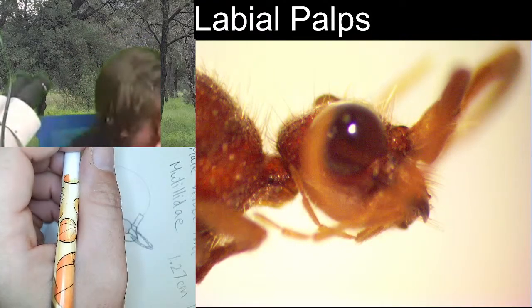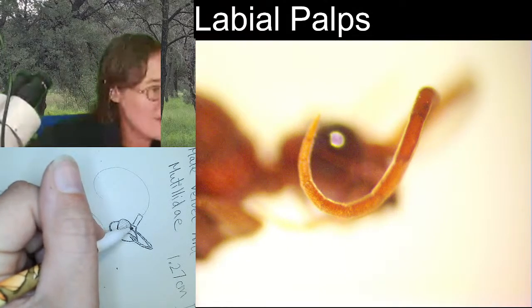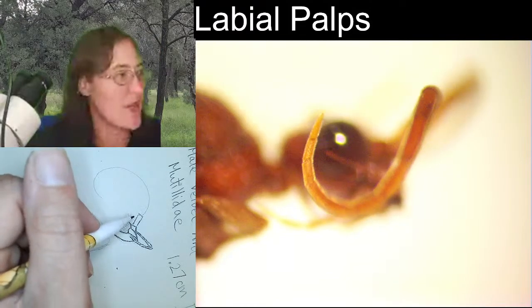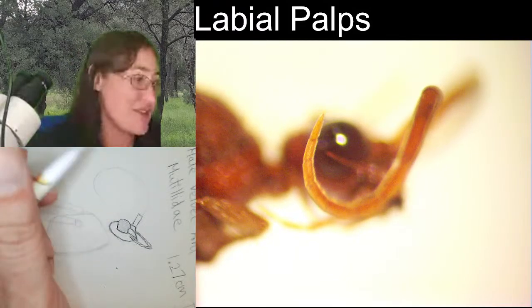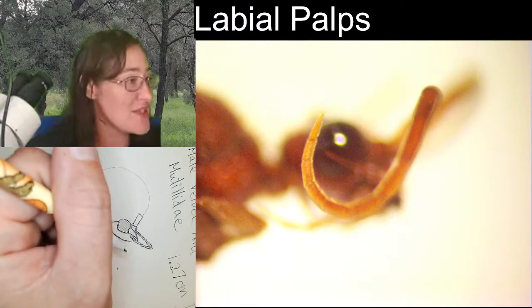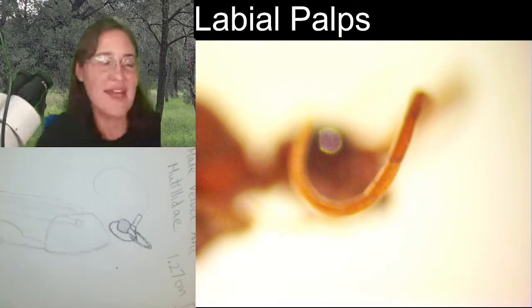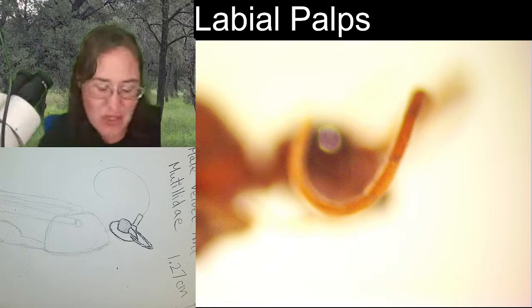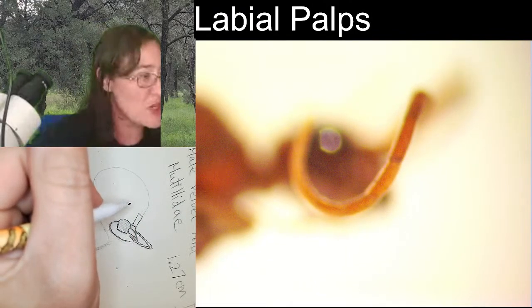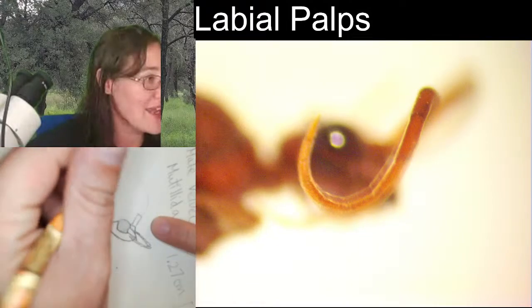Also, the antennal segments, once you get past that first segment, they do stay mostly even in width until the very last approximately 3 segments. And all of the segments are very smoothly connected to one another. That's different than a lot of the beetles we generally look at, where there's this huge segmentation in between the antennal segments. So this fella right here is pretty smooth, which is what I'm going to do here.